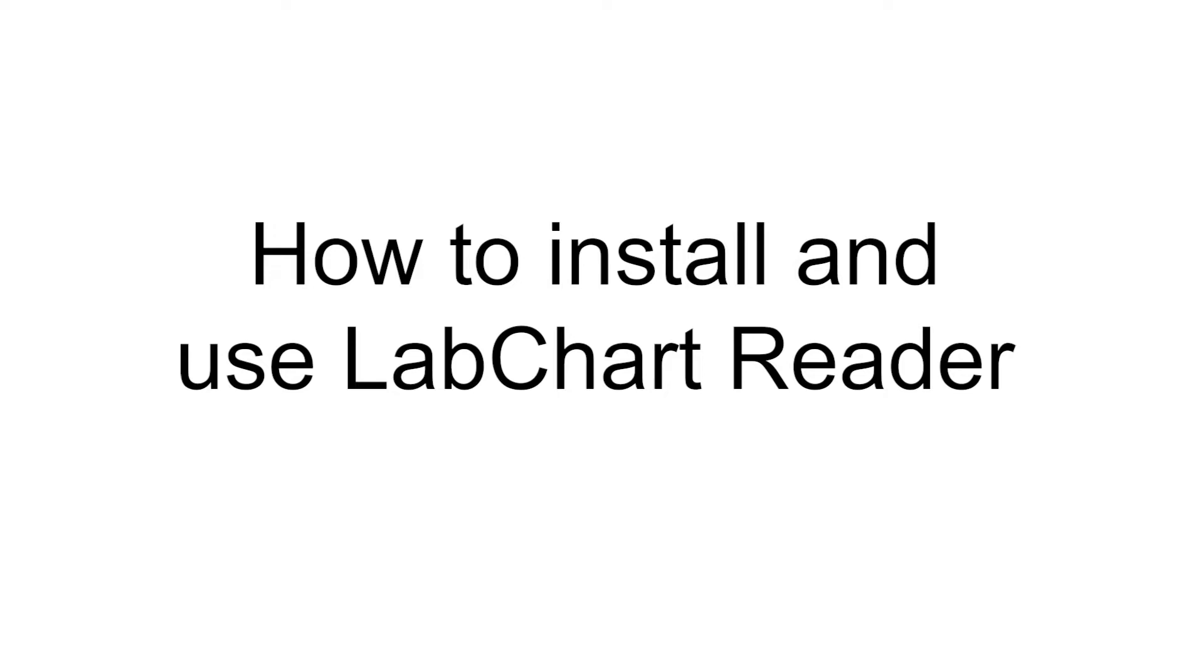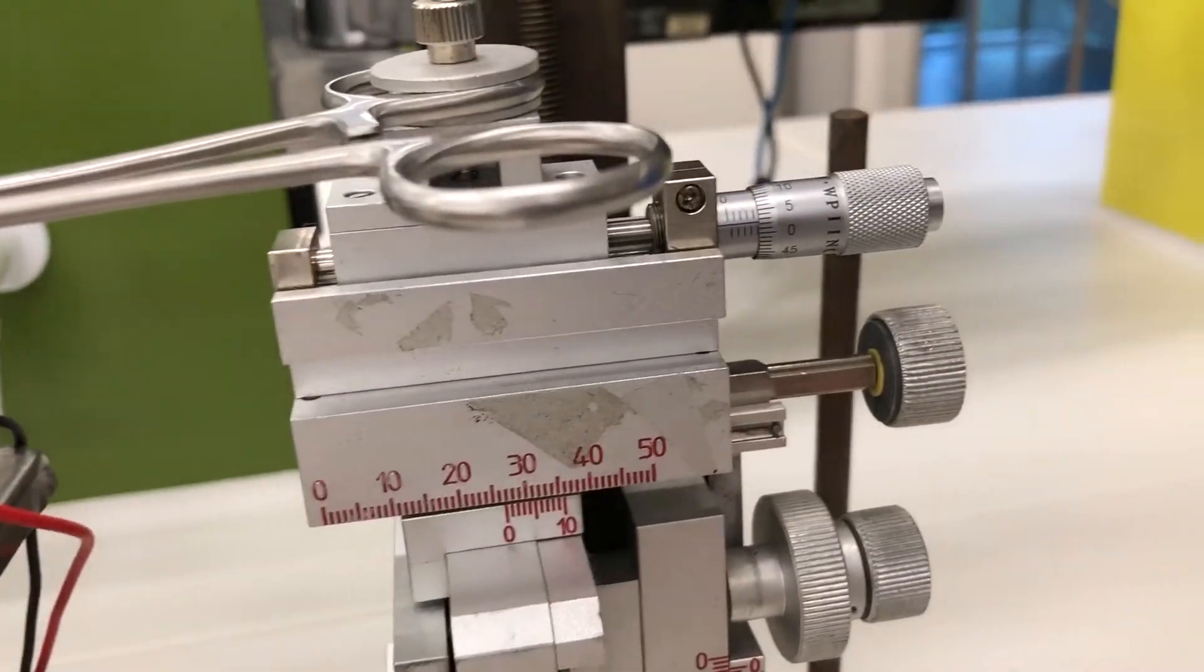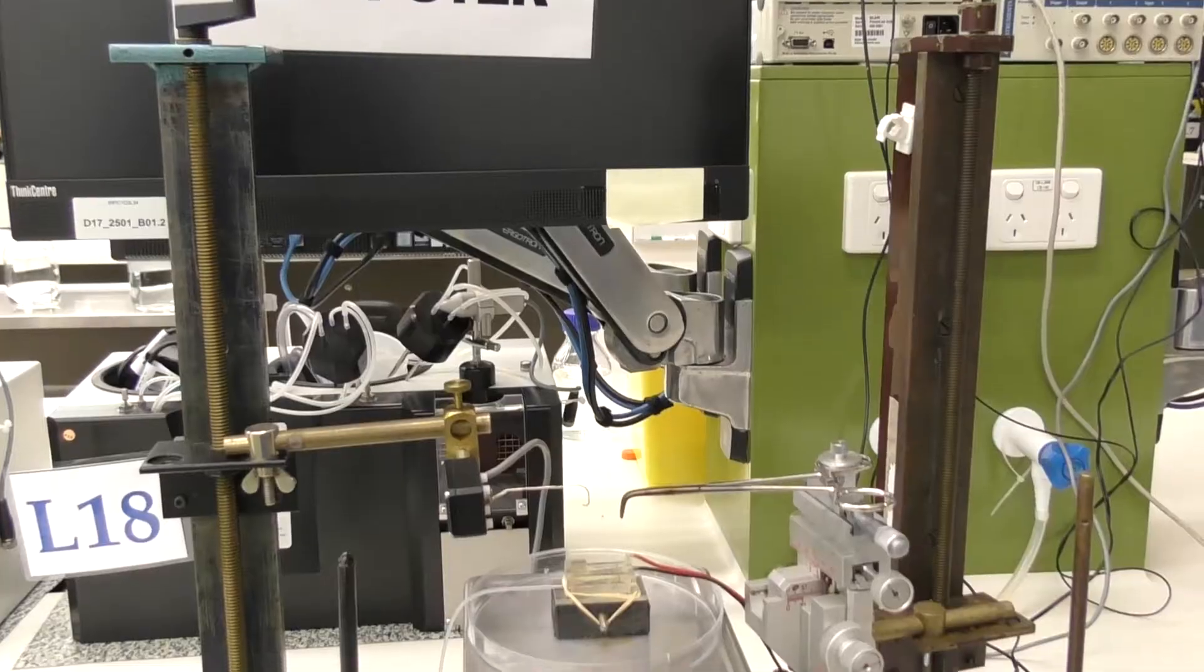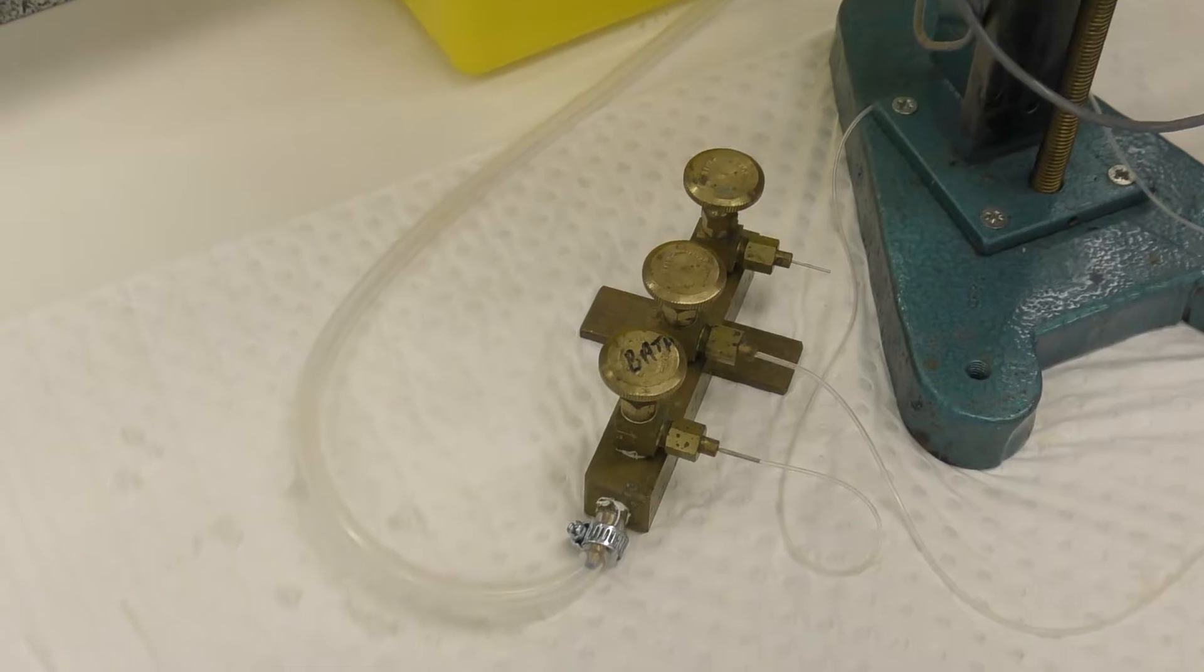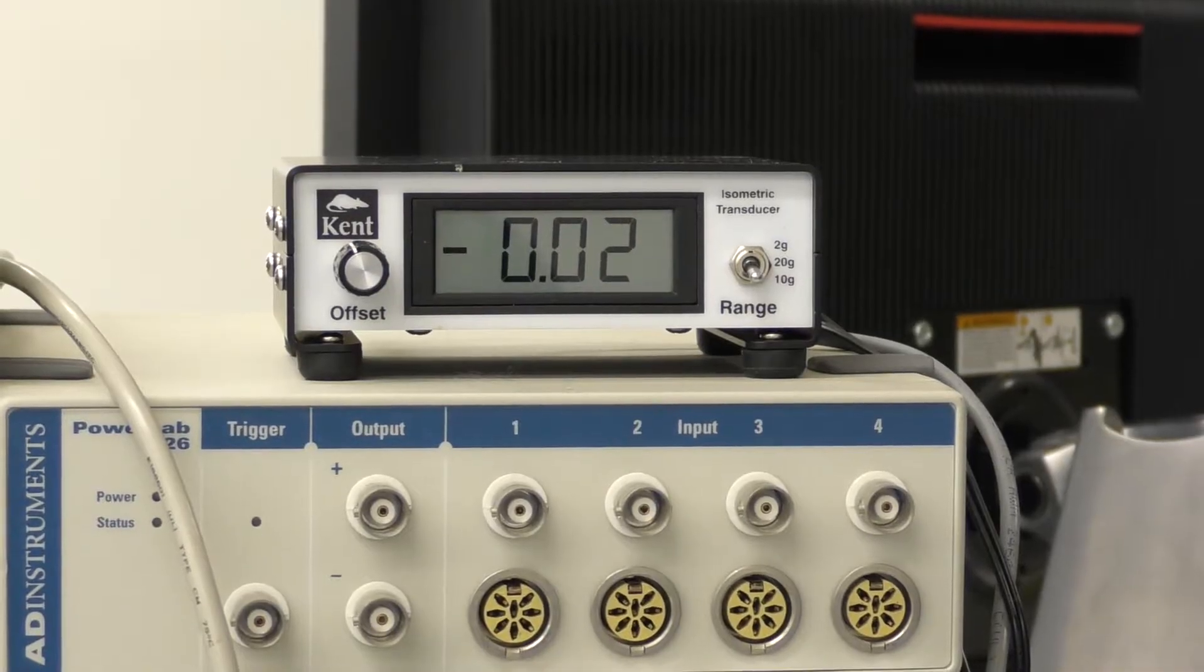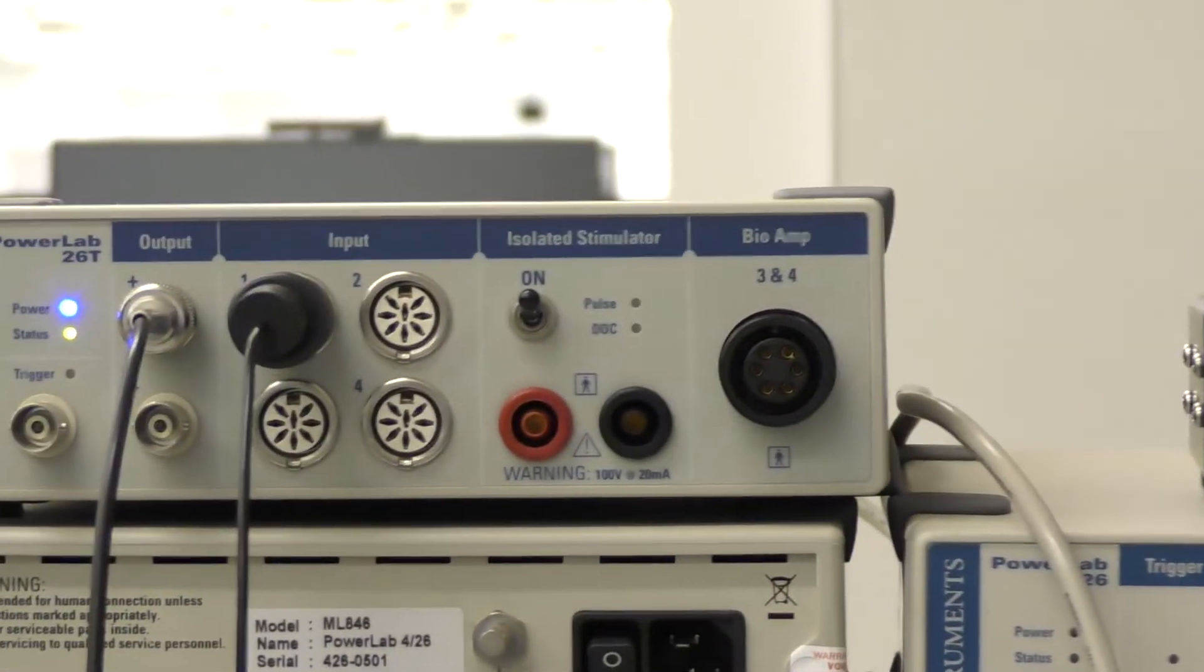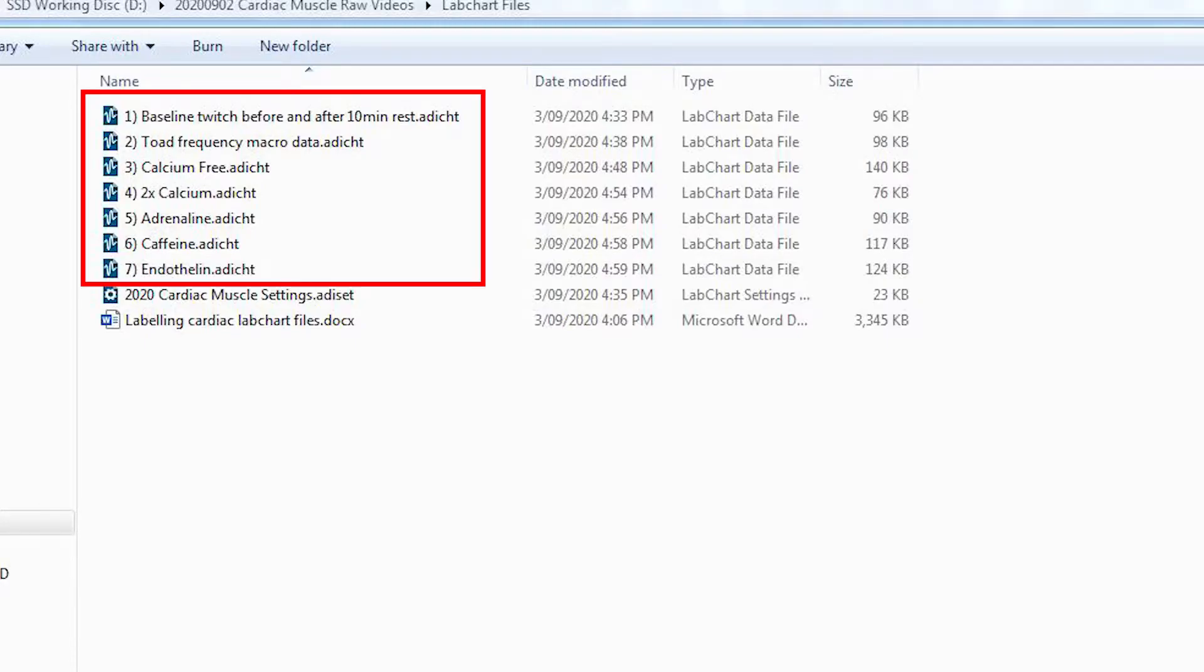In this video, we'll be looking at how to install and use LabChart Reader, particularly for those of you working along at home. Unfortunately due to COVID, you won't have access to the equipment that you need in order to run these experiments, and so we've run the heart tissue through each of the experiments and have provided these data files for you so you can still perform the rest of the experimental work for this practical.